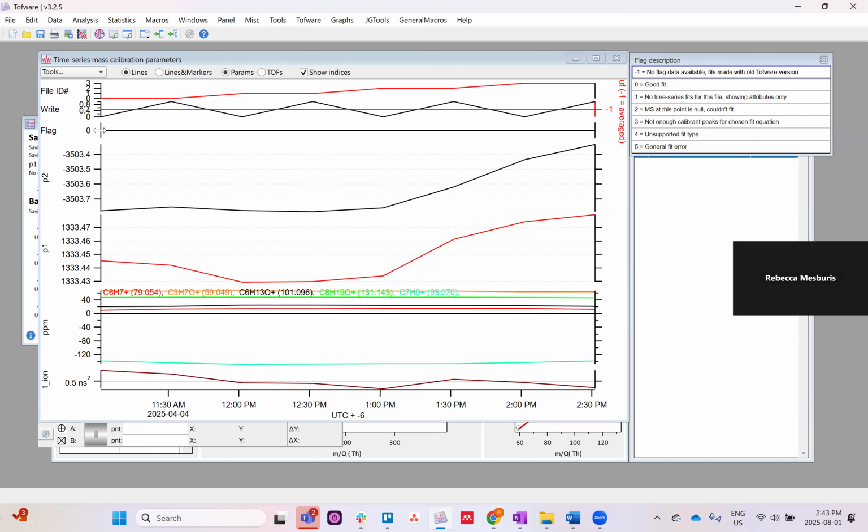Next up is parameter 1 and parameter 2. These are some of the parameters that we custom built during our previous workflow steps. And in general, I just like to check that the axis ranges in both of these are relatively narrow, and they are, so that's good enough for our case here.